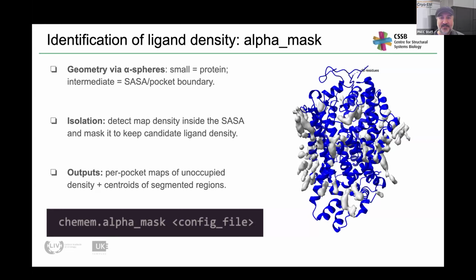All right, to switch gears a little bit, is it possible to use these methods on just nucleic acids and nucleic acid protein complexes? Yeah, I mean, TEMPy-ReFF will happily refine RNA as well as nucleic acid complexes. This is totally possible. ChemEM is more meant for just small molecules rather than whole complexes.